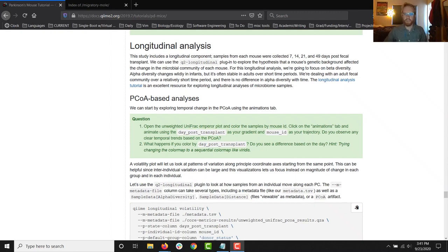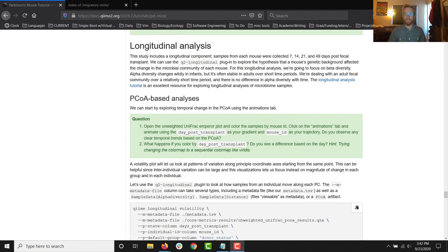Hi folks, it's Chris again. This time we're going to talk about longitudinal analysis of microbiome using the Q2 longitudinal plugin. During this section of the tutorial we're going to run a few new commands including QIIME longitudinal volatility, which we'll get to see in more than one different way. We're going to look at QIIME longitudinal first distances and QIIME longitudinal linear mixed effects, which calculates and visualizes a linear mixed effects model for us, which can be super useful.